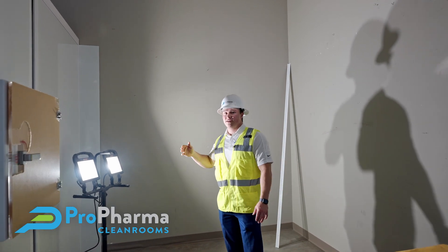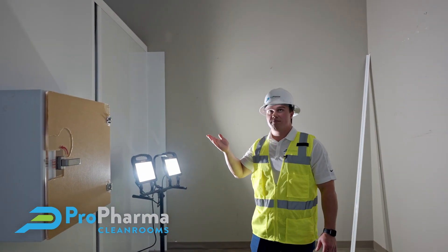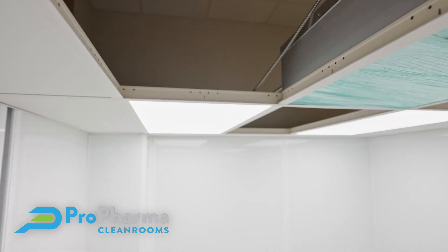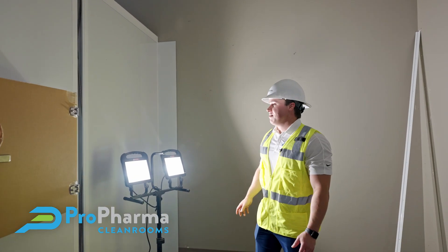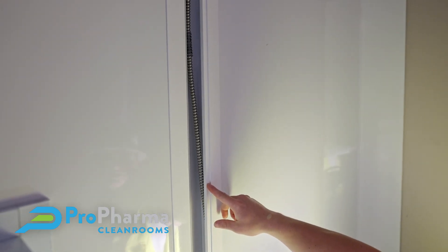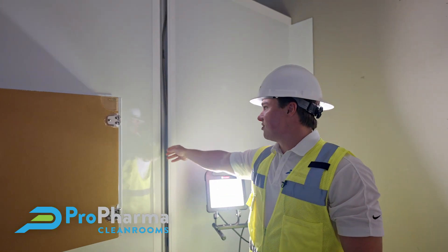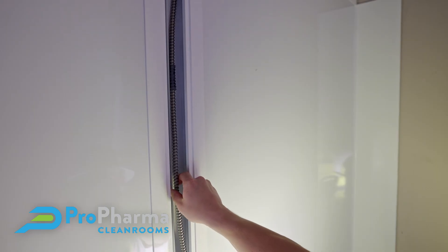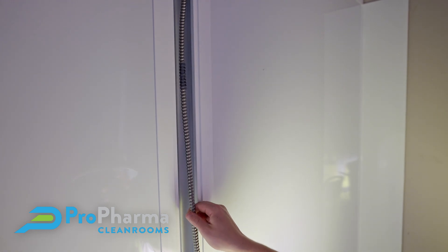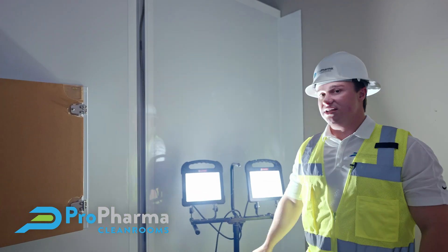The ceiling height also makes it easier for staff to clean the ceilings, which has to be done once a month, giving them a more easily cleaned environment. If you come this way, you can see we have a wall chase right here, designed into our walls. Instead of having to cut holes into our panels, we're able to run our electrical conduit down the wall, cap it off, and silicone it very nicely to the wall so it meets USP standards.